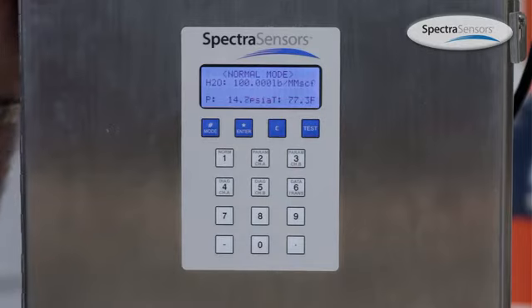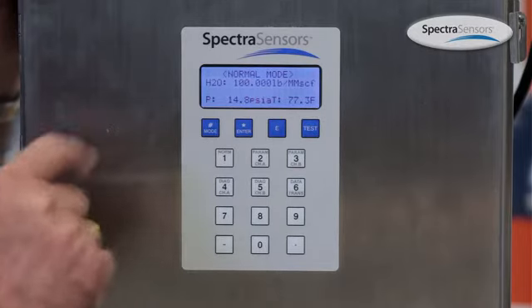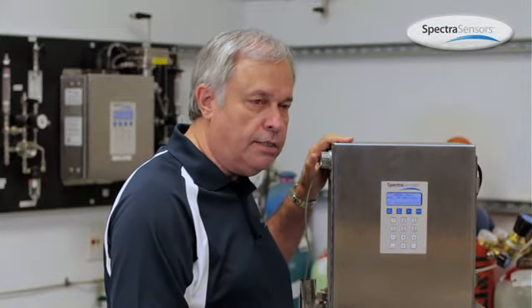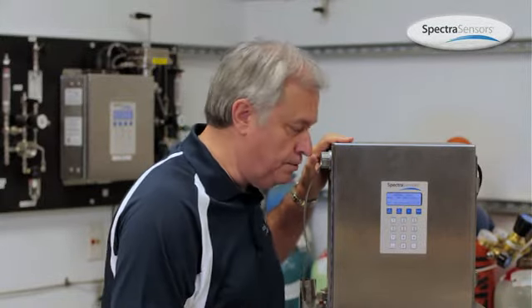If it is an ARM9 analyzer, we must page further down until we see what the baud rate setting is for the analyzer and make a note of that. And then we are through with that analyzer.